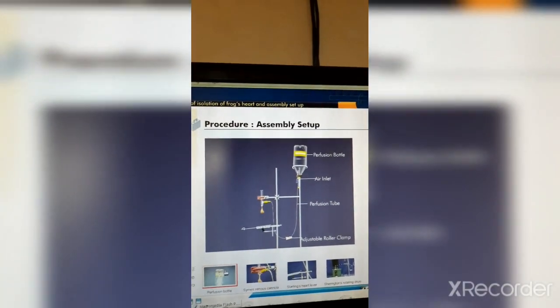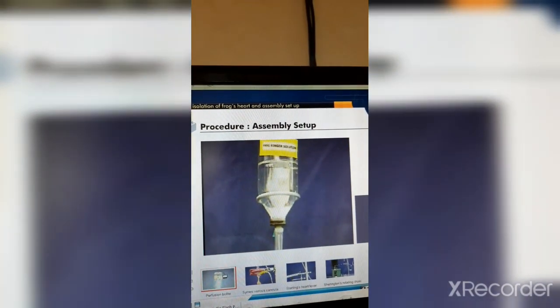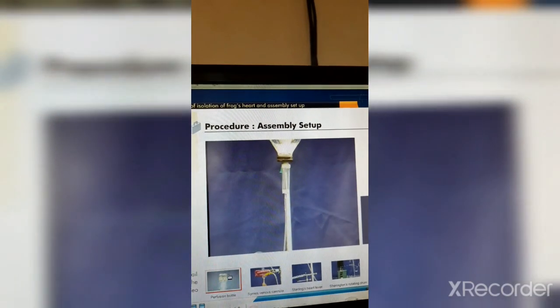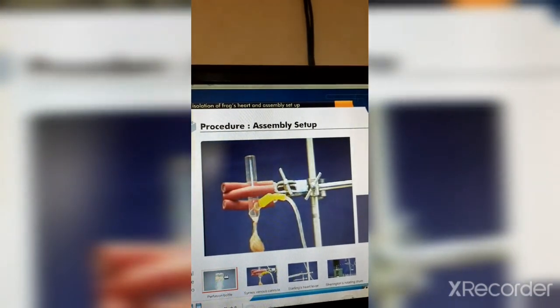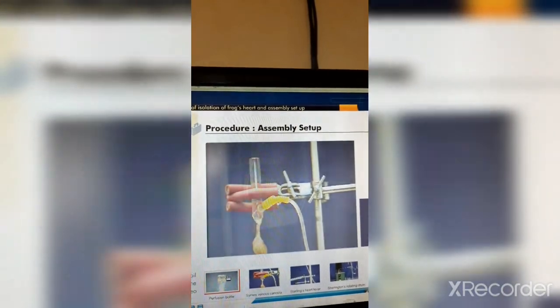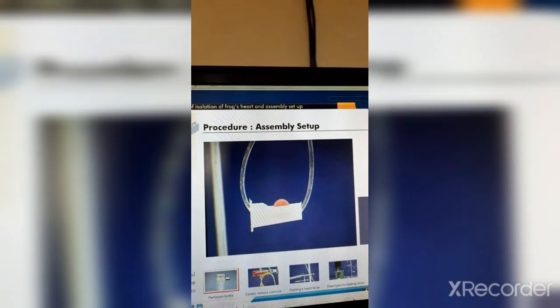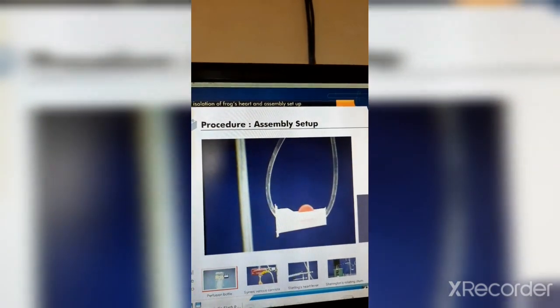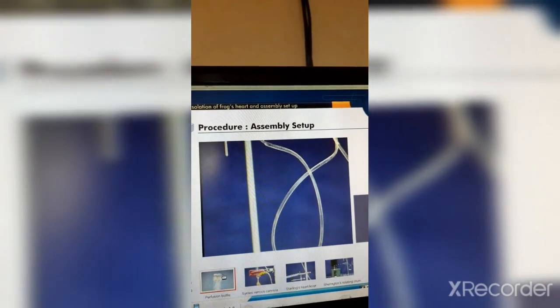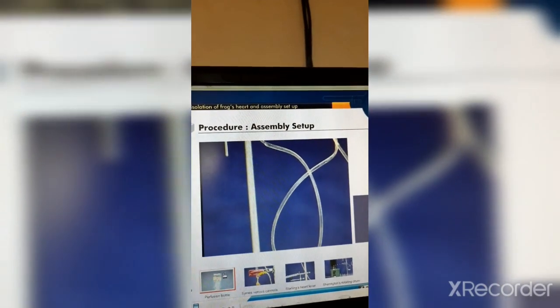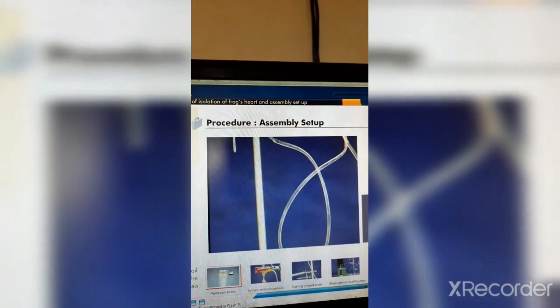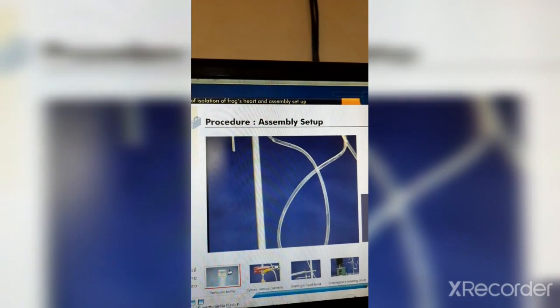The perfusion bottle contains frog Ringer solution and is mounted at a specific height on a round clamp attached to a stand. The perfusion bottle is connected to the side branch of Sim's venous cannula. Glass containers that have no air tubes require an air inlet. An adjustable clamp of roller type controls pressure on the perfusion tube to regulate the flow of frog Ringer solution. Conventionally, IV bottle and IV set are used for the same purpose.